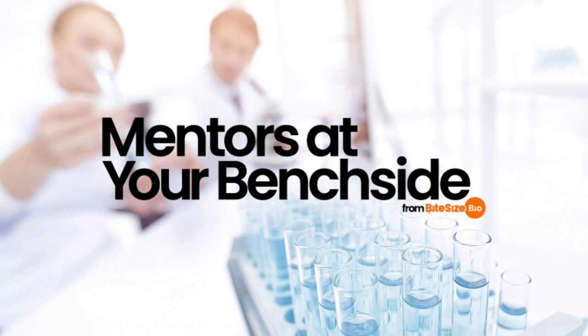For every measurement we make, there is an actual value that we are trying to obtain. Furthermore, whenever we prepare a material by weighing or dispensing it, there is a target value we are trying to reach. Simply put, accuracy is how close a measurement is to the actual true value, whereas precision is how close those measurements tend to be to each other.